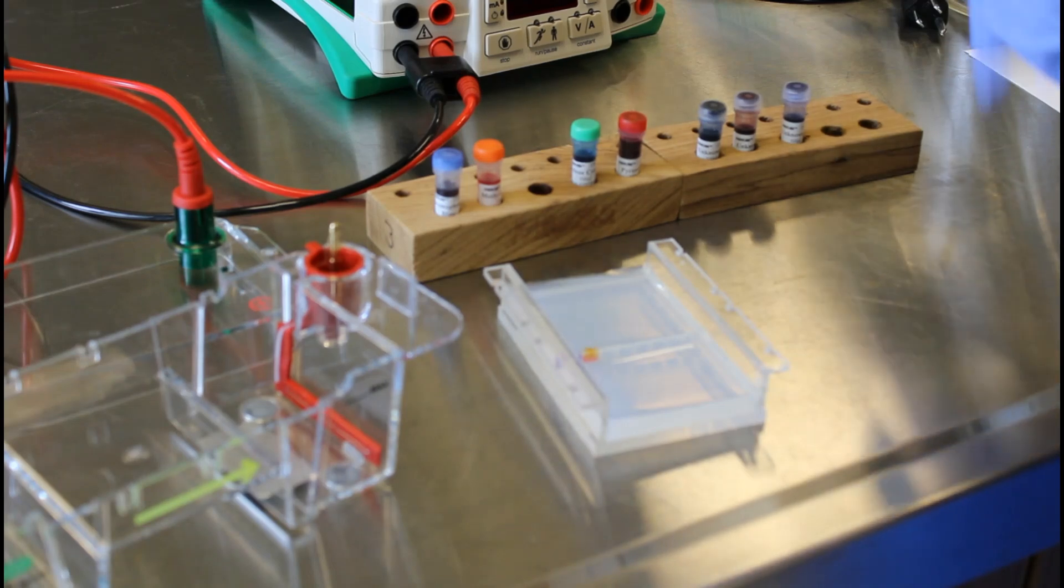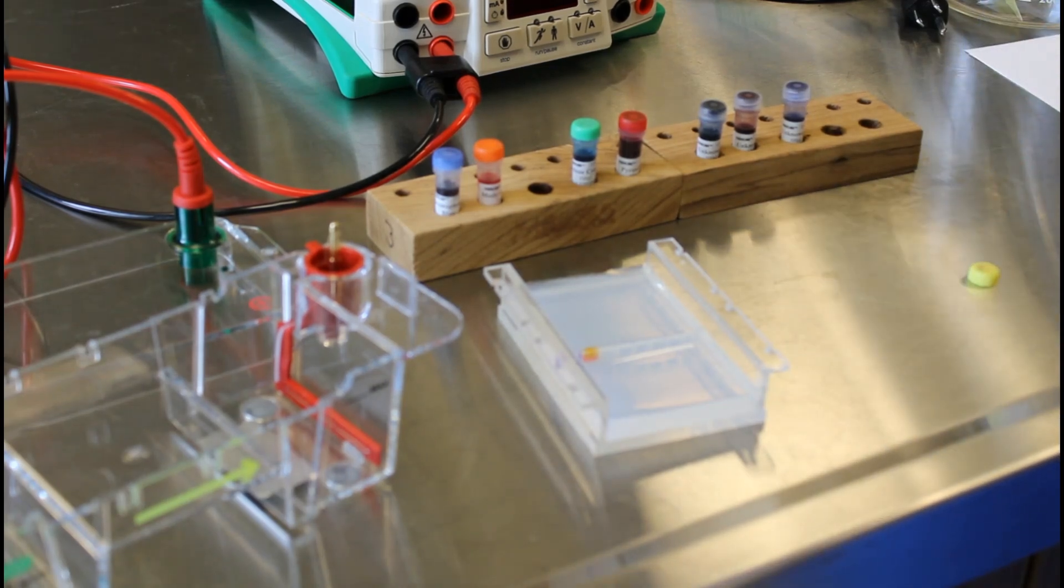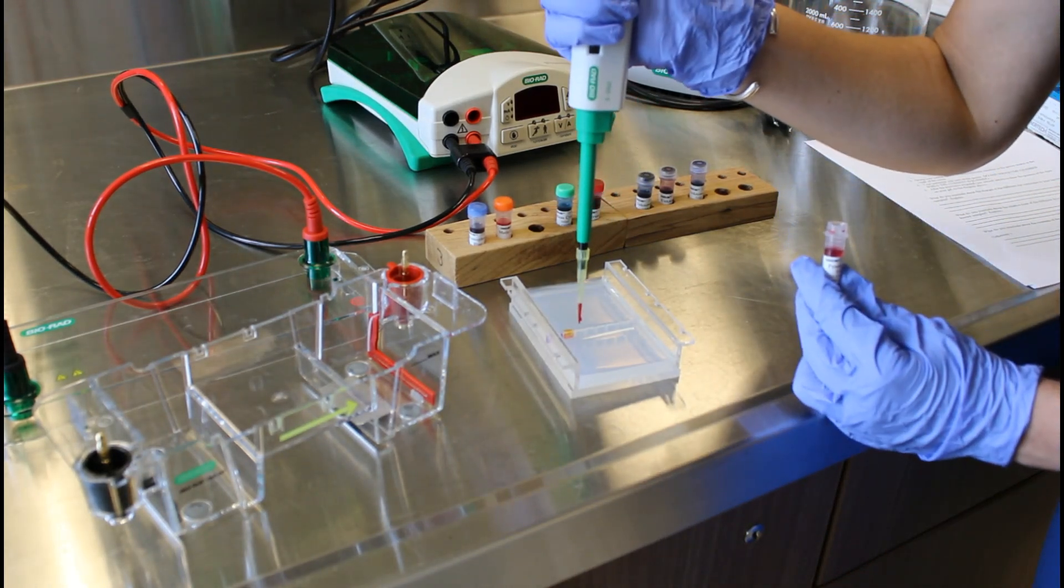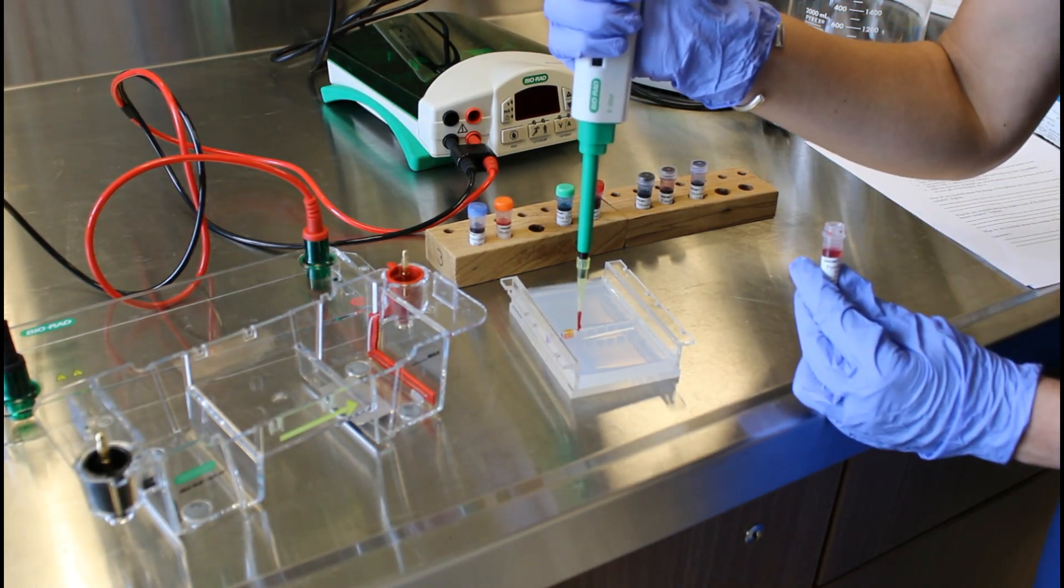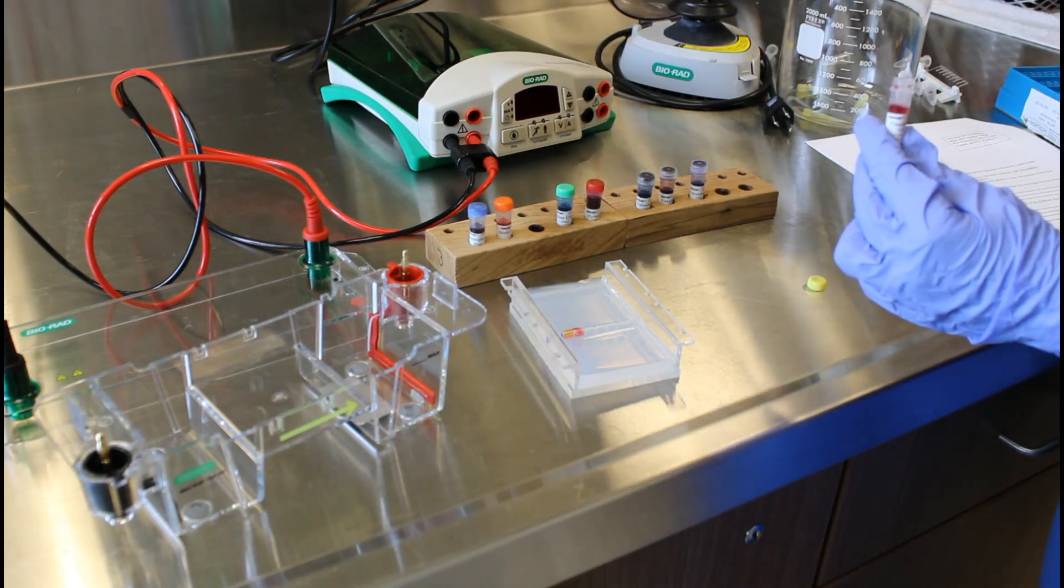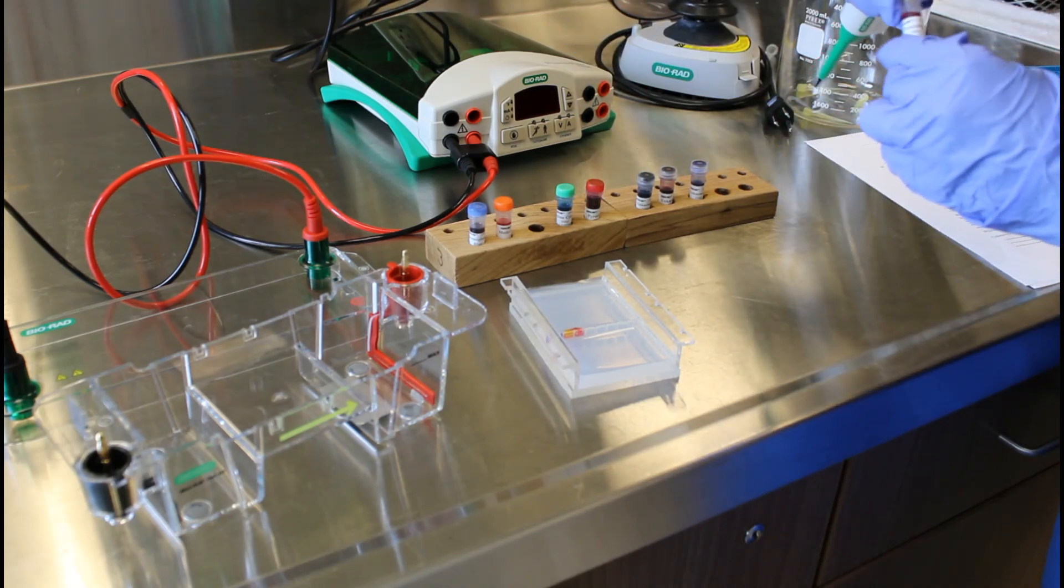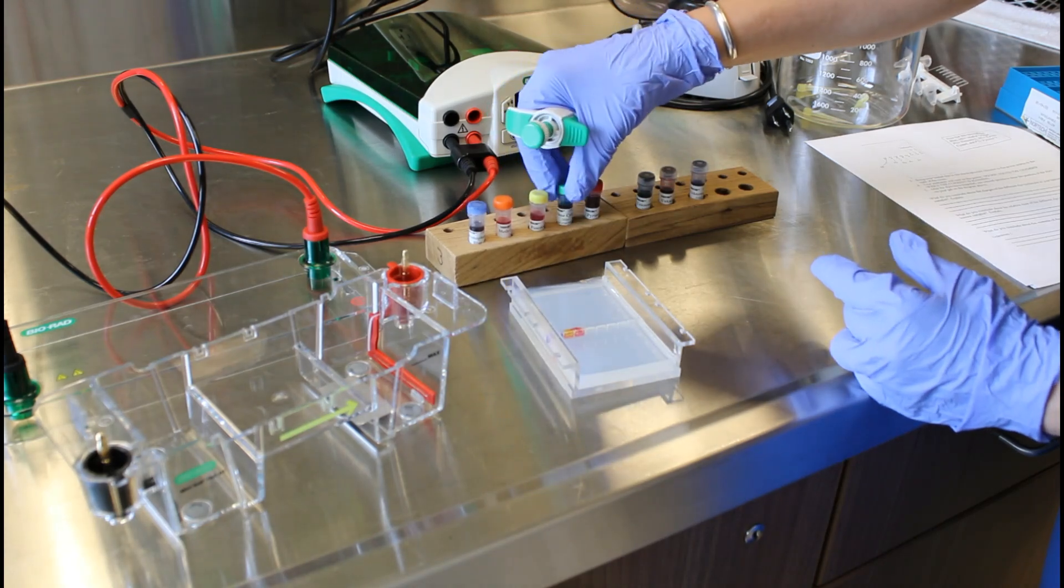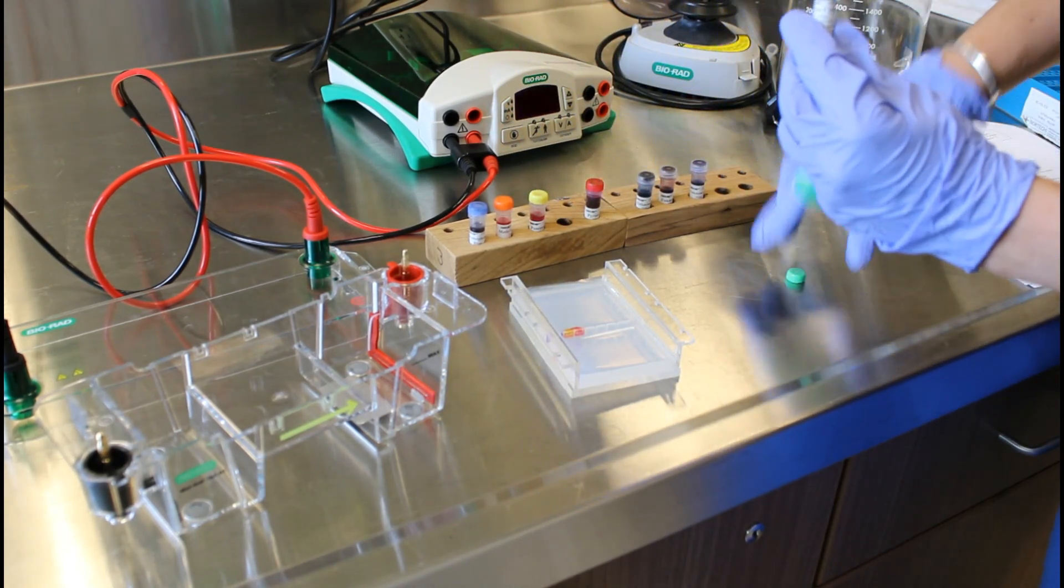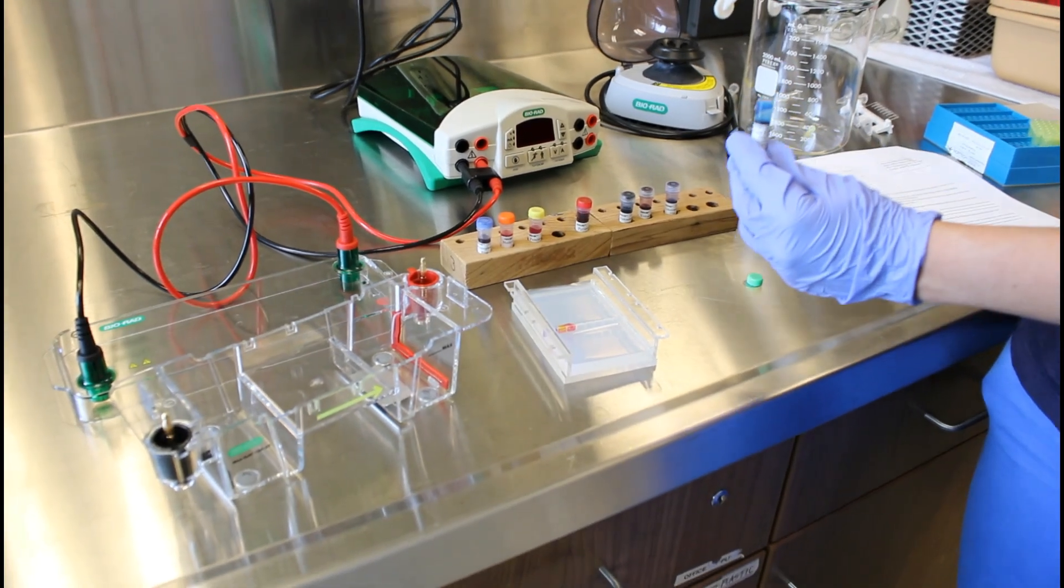This is our PG dye. I'm going to grab 20 microliters, try to get it all in the well this time. Mostly. Then I'm going to load up our XC, our xylene cyanol. I'm going to get a new tip.